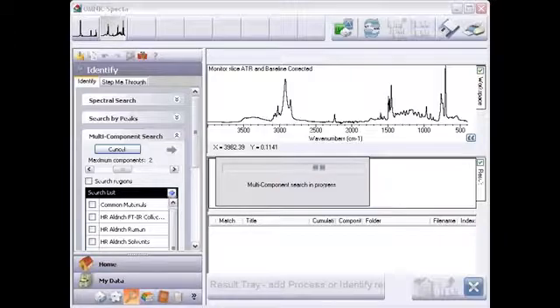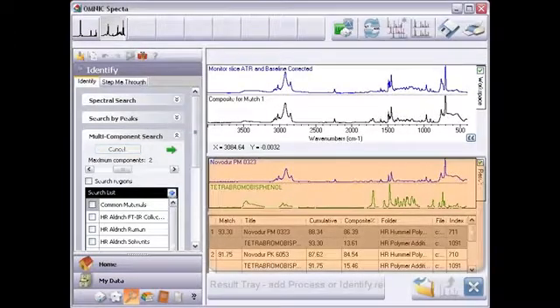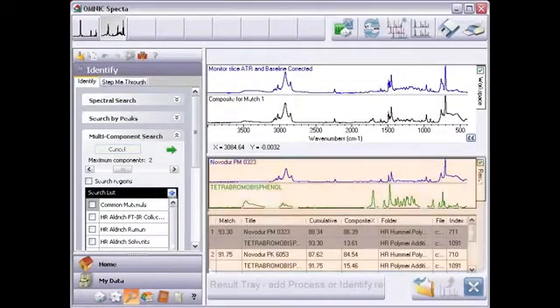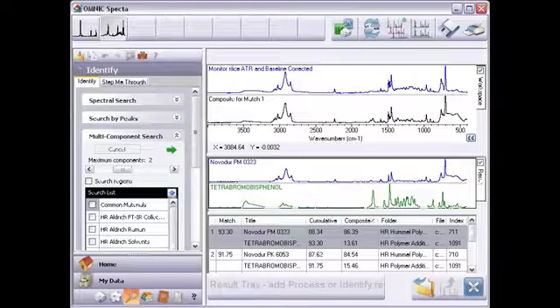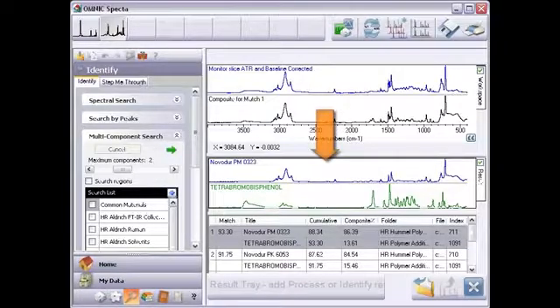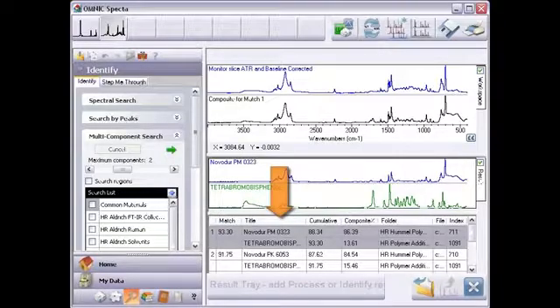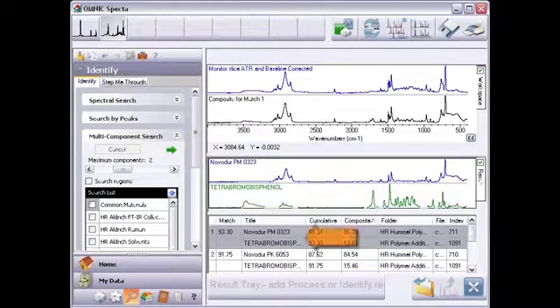The search results appear in the result pane. Each match is a set of two spectra. The found spectra for the best match appear here. Information about each match appears here. The best match is listed first.